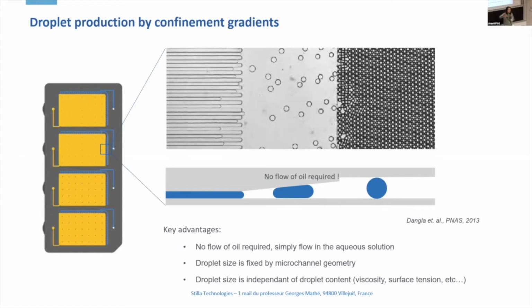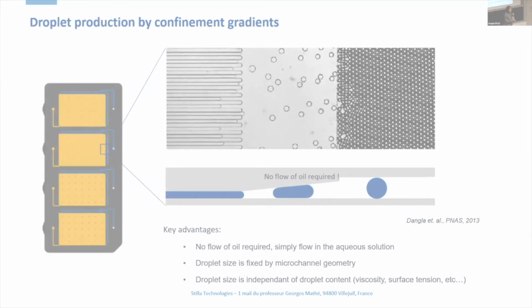And the droplet will propel outside of that geometry and then reach the chamber where they self-assemble in what we call a droplet crystal. So there's really a 2D layer of 30,000 droplets in each chamber. So during that step, we distribute randomly the target sequence in these droplets.